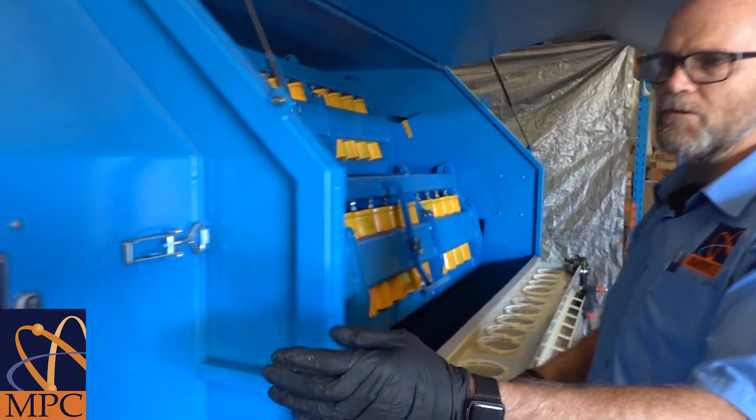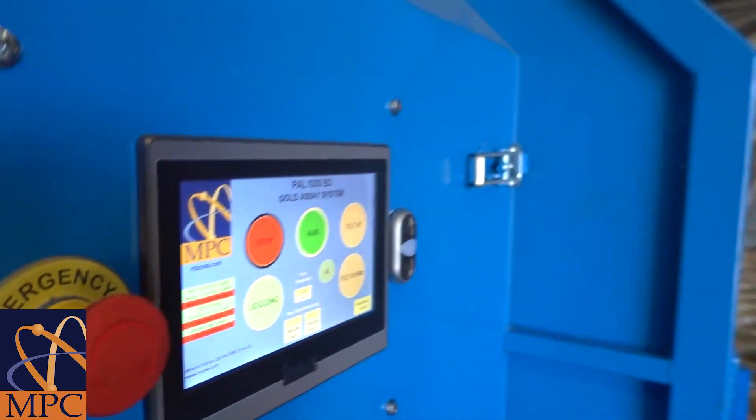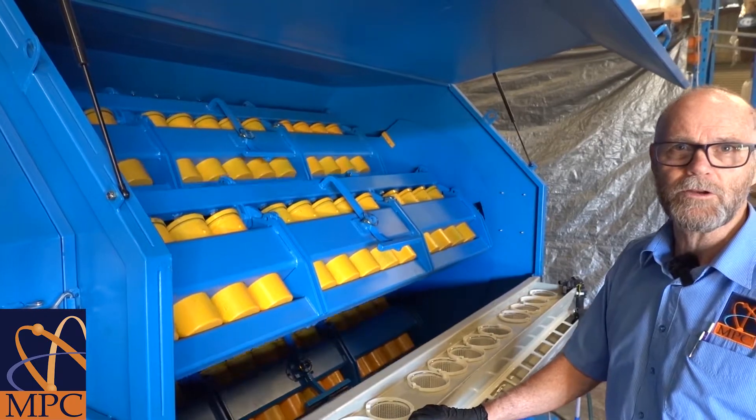First step is we go to our HMI panel and press the jog button, which moves the bottle arms around into the correct position for loading and unloading.